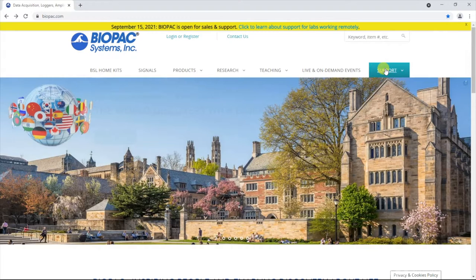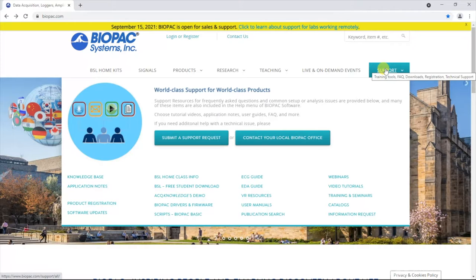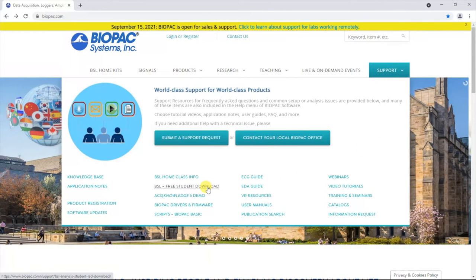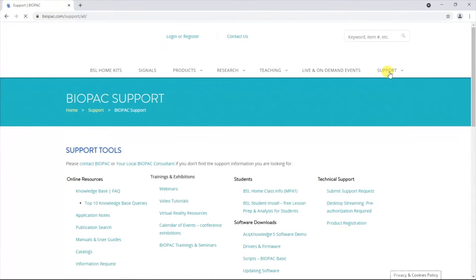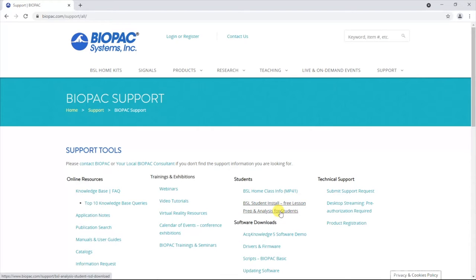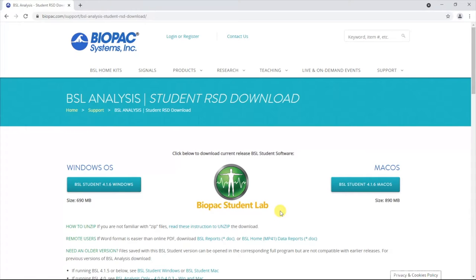From here, you will have two options to get to the application downloads page. If you hover your cursor over the Support tab, you may select the BSL free student download option from the floating menu. If you click the Support tab, however, a new page will open where you can select BSL Student Install: free lesson prep and analysis for students from the list of options. Either method will bring you to the BSL analysis download page.